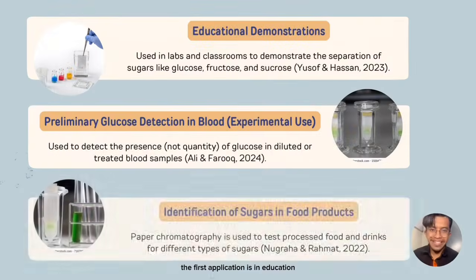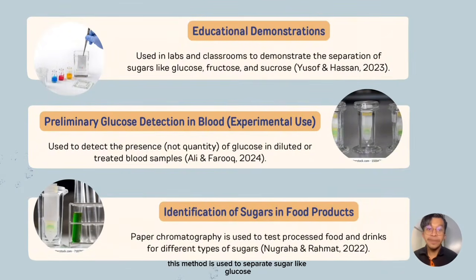The first application is education, demonstration in labs and classrooms. This method is used to separate sugars like glucose, fructose, and sucrose. It helps students understand the concept of separation and how RF values work.